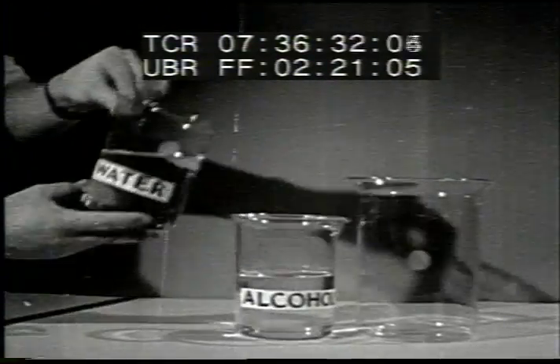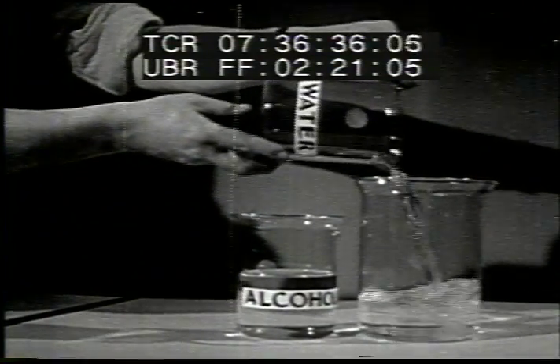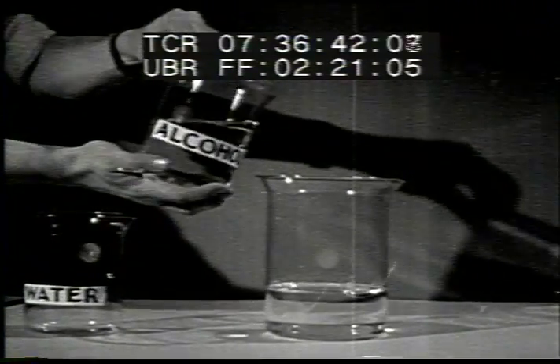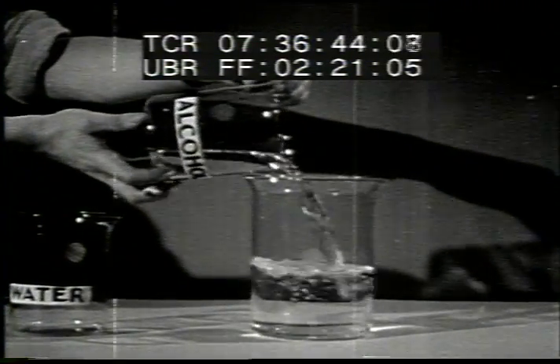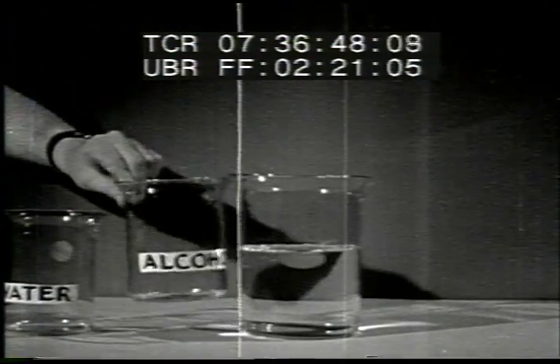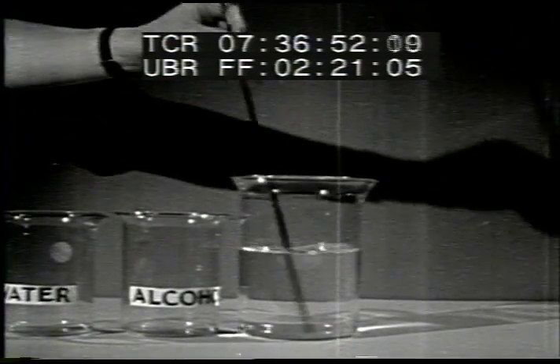Solutions may consist of 2 or more liquids. To illustrate, let us pour some water into this container. Now, let us add some alcohol to the partially filled beaker. You will note that the liquids appear to dissolve in each other. The alcohol and water are mutually soluble. Such liquids are said to be miscible.